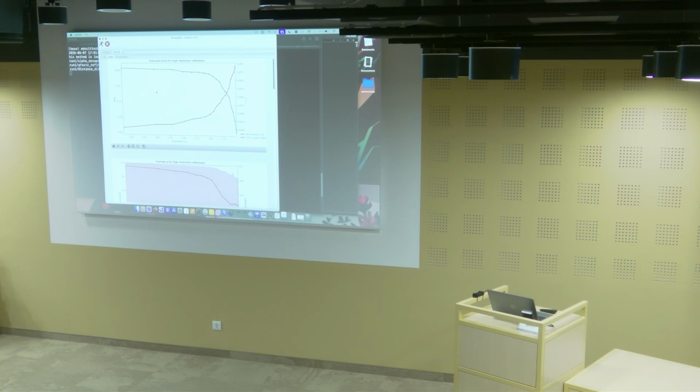If the structure factors are very much the same, we have high isomorphism, and so this R value should be low. Especially at low resolution, which we can find over here, we want this value to be low, because the global structure of my protein remains the same. At higher resolution, there will also be some more noise, and this will rise.